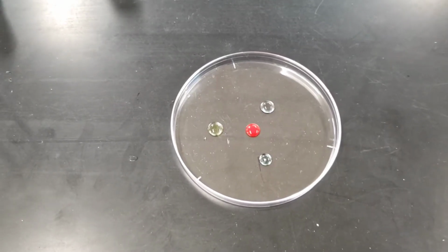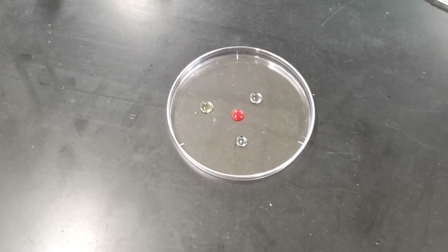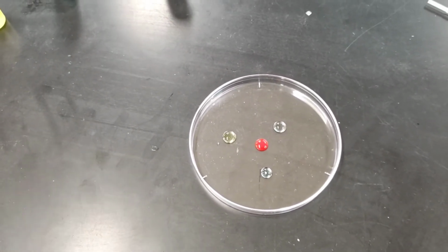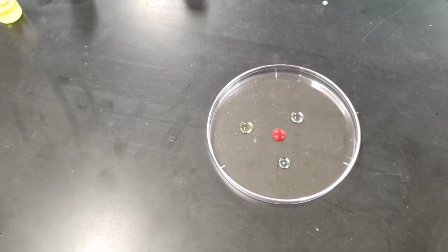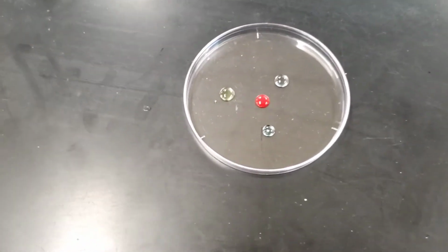Hey folks, some of you are having a little trouble understanding what you're supposed to see in this lymphatics lab. So I thought I would do a demonstration here, just to show you. I can't really show you the lab because of the time it takes, but I can show you how it should be set up and what it looks like.